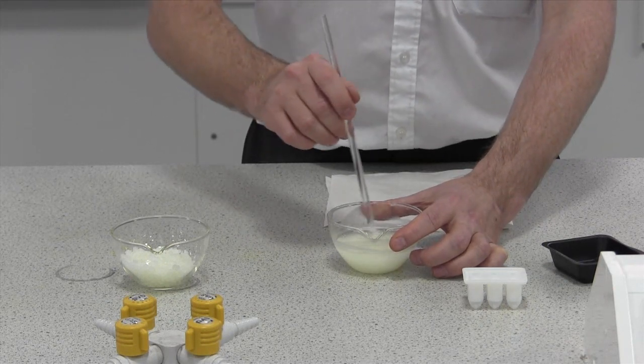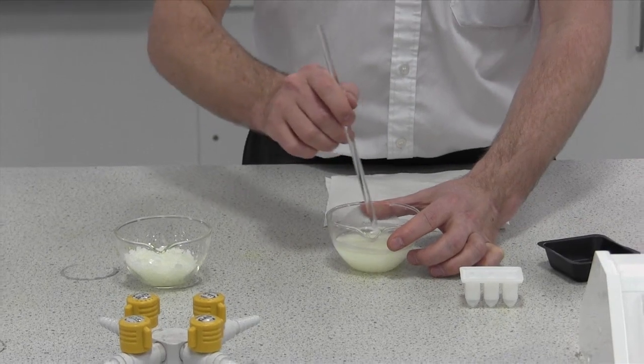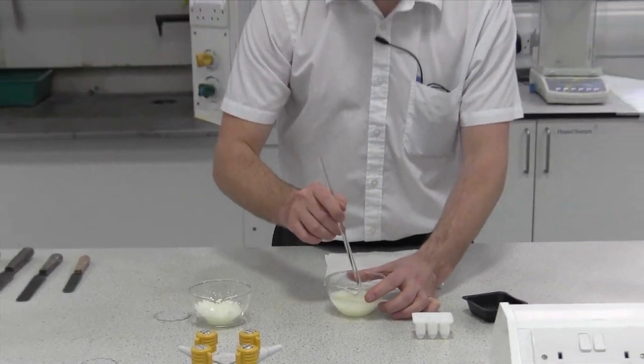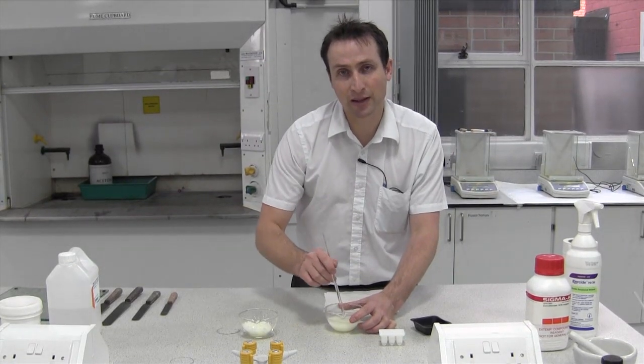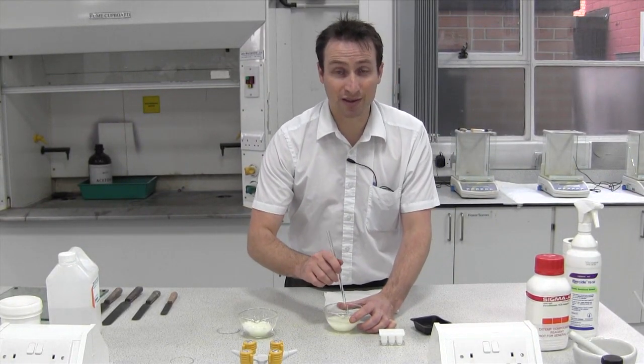I normally suggest you stir until it cools slightly as well. It makes it easier to pour into the moulds, and it also makes sure that whatever you have dispersed into this base is more evenly spread, which makes your suppositories more consistent.